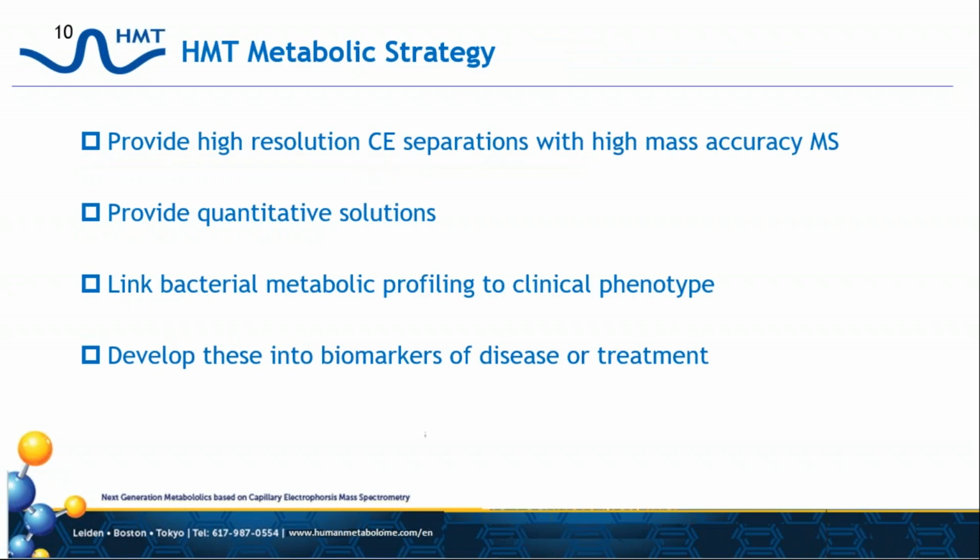Our strategy then is to apply capillary electrophoresis to separate these mixtures in combination with high mass accuracy mass spectrometry, and also to provide quantitative solutions.